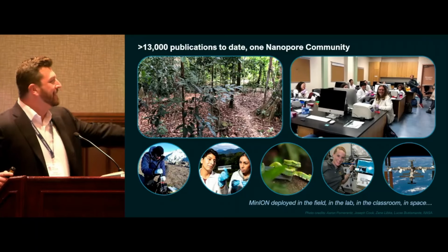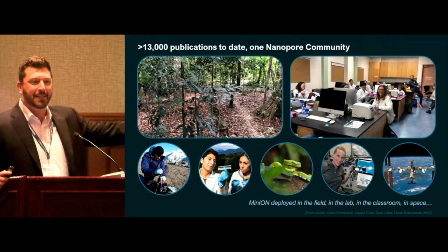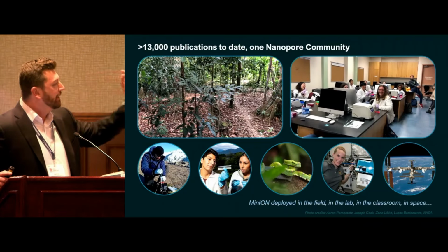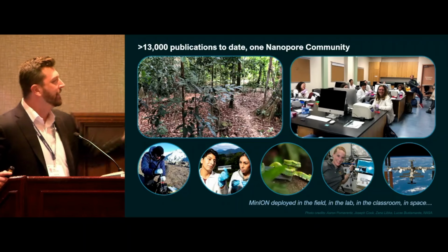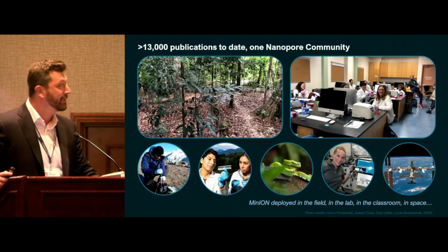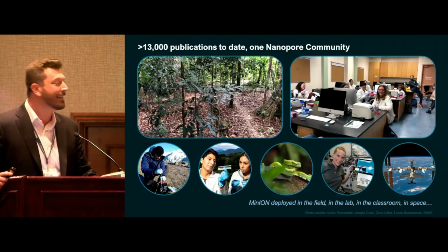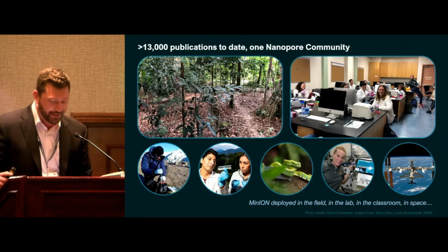You see some amazing examples here. We've got researchers who have taken this out into the Arctic. We've got the Ecuadorian Amazon. That's a shameless plug. That's a snake that I sequenced out in Ecuador. Bothriechis schlegelii is the species name. And of course, we've got Kate Rubins, who was the first person to sequence DNA up in space aboard the International Space Station.